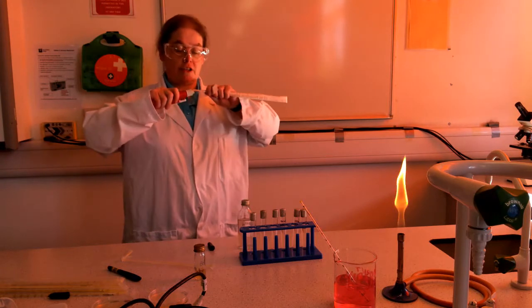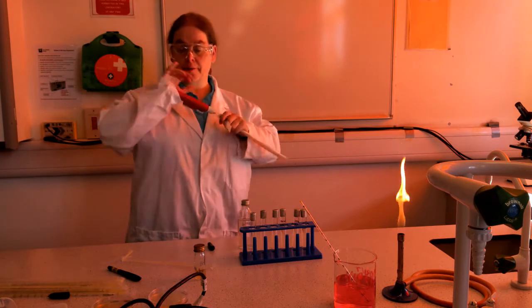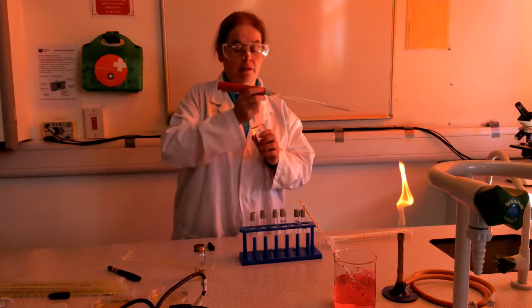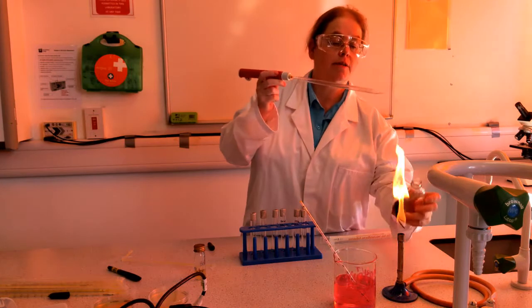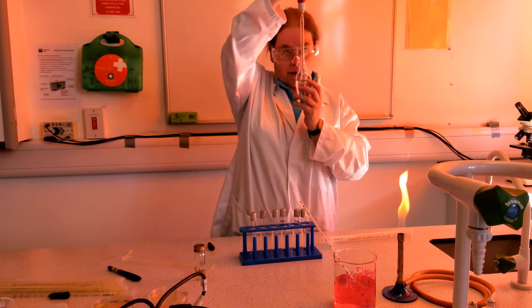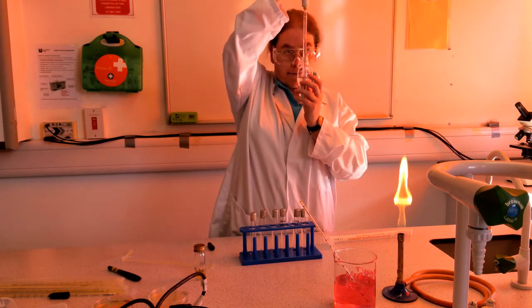But I can touch this end, because this end isn't going anywhere near my bacteria. In you go. And again, as far as possible, using correct sterile technique, a little harder with these large bottles. We will draw up 9.9 millilitres of water.